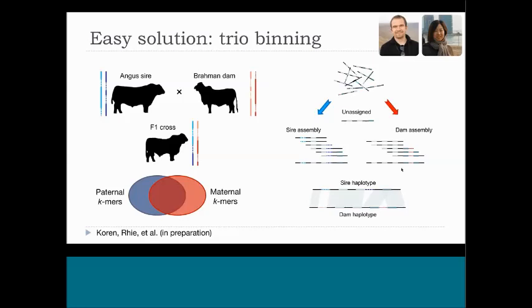And in the case of these two cattle subspecies, over 99% of the initial raw PacBio reads were assignable to the haplotypes prior to assembly. And so we get a very complete assembly of each haplotype as a result. And then when you want to go back and explore the differences between those two haplotypes, you have a linear reconstruction of each haplotype, so you can simply align them to one another to find very accurately all of the structural variation between them. And so this is more advantageous than, say, inbreeding in my mind, because you have actual haplotypes of an actual living, breathing, healthy, happy individual.